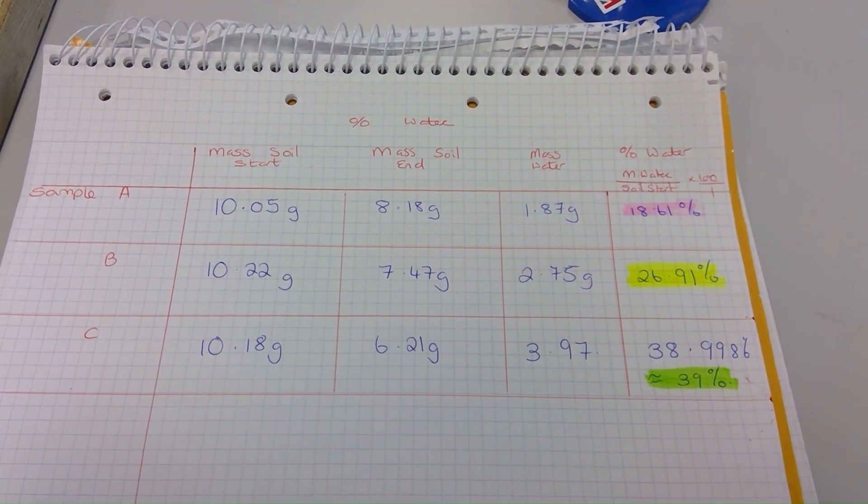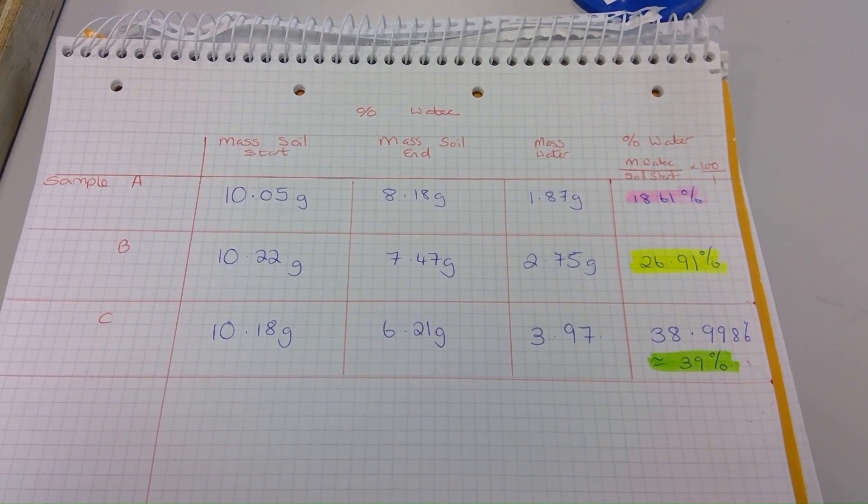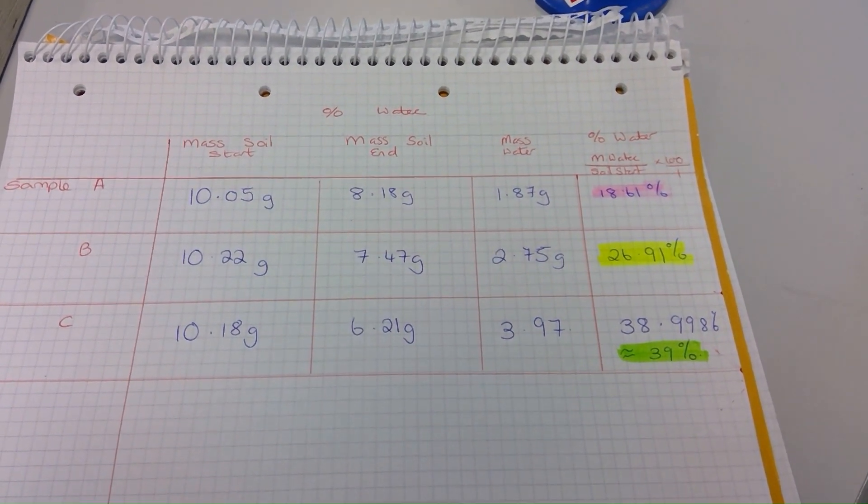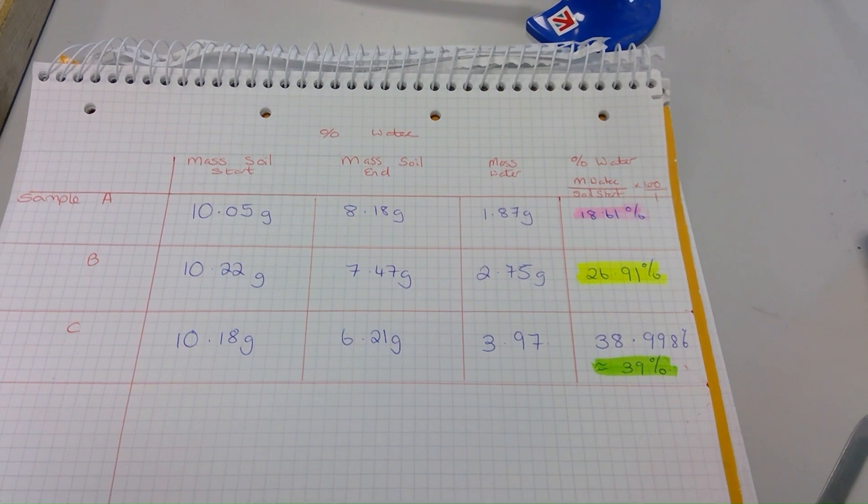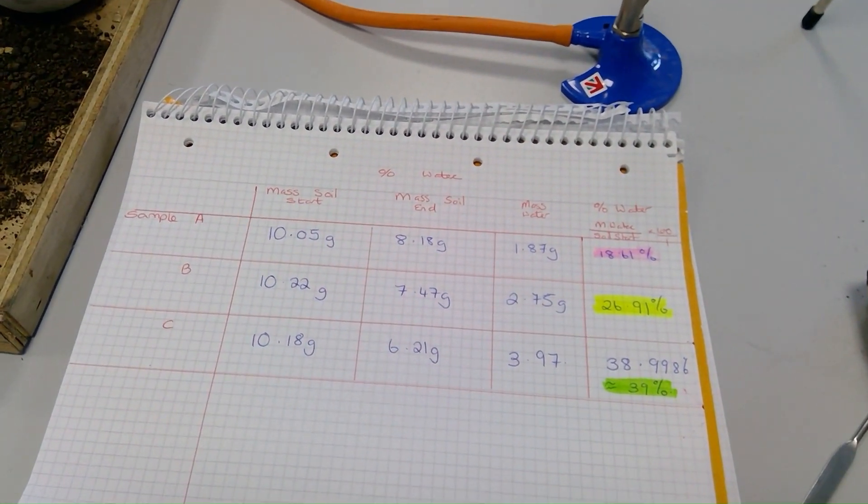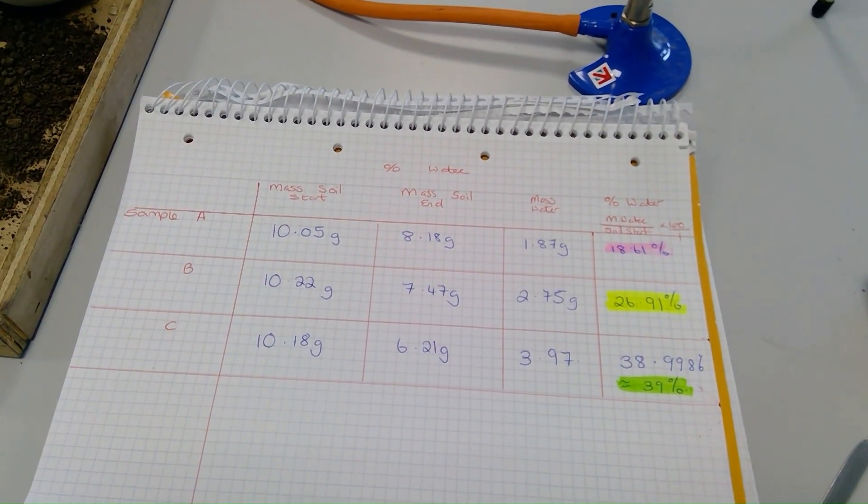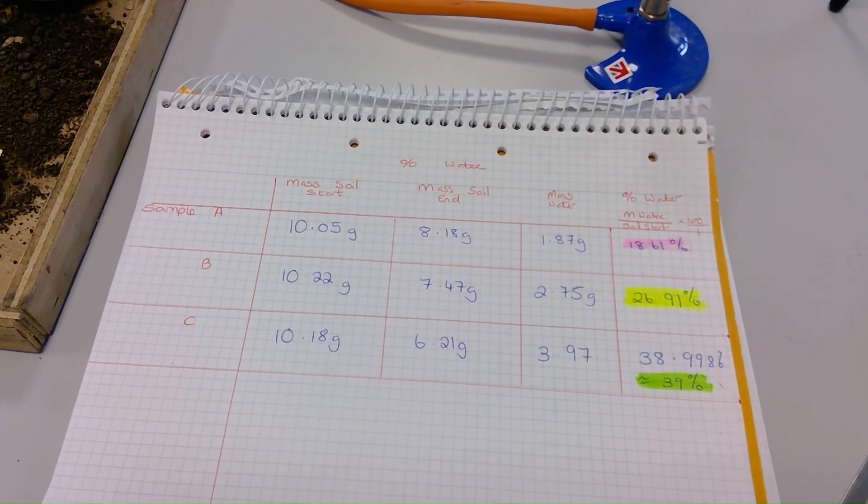And C, which had farm yard manure, no synthetics, and was being grazed in a strip grazing manner, had a water retention of 39%, even though they felt like they were dry before they went into the oven. So that just goes to show, again furthers my theory that the darker color soil has a higher organic matter content.